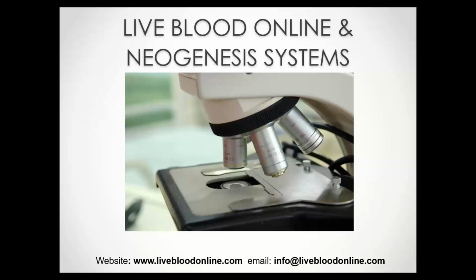Well, the test itself involves taking a drop of blood from a client's finger and analyzing it under a special type of microscope. We prepare two samples from the same pinprick, one for live blood analysis and the other for dry blood analysis. Now, it is a visual analysis, so the trained practitioner would physically scan through the relevant areas of a sample, looking for particular indicators or deviations from what a healthy or normal sample would look like.